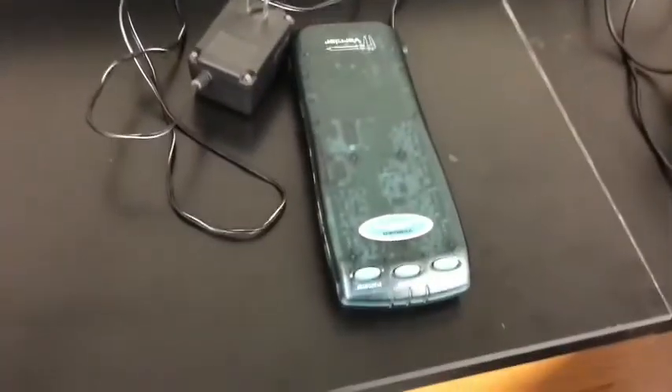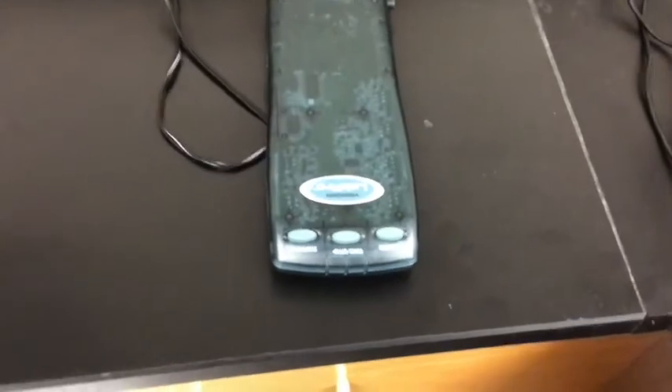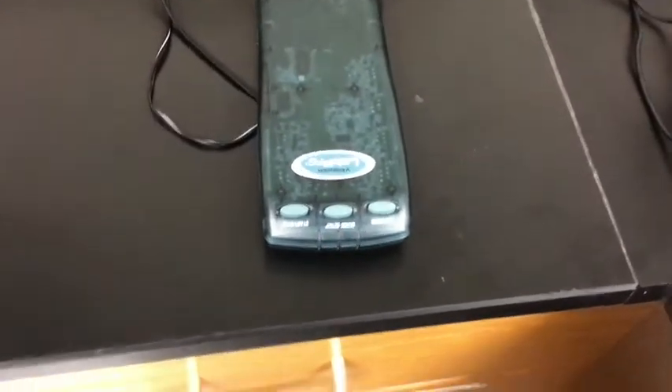First things first, we've got to make sure this device has power, so we're going to plug it in. You know that it's got power if it gives you a nice little beep after just a second. And there it is — so it's got power.